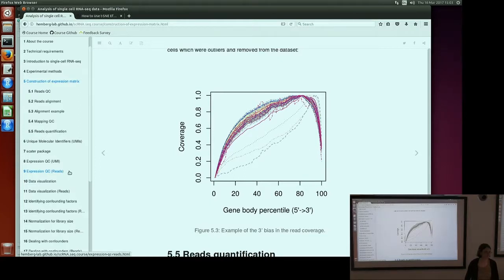Yeah, no, that's a valid question. What we found from work on the differential expression methods for bulk was that characterizing the mean-variance relationship was the most important thing when it came to getting good differential expression results. And I think that's still an open question in the single cell area. What is the right model for addressing this?